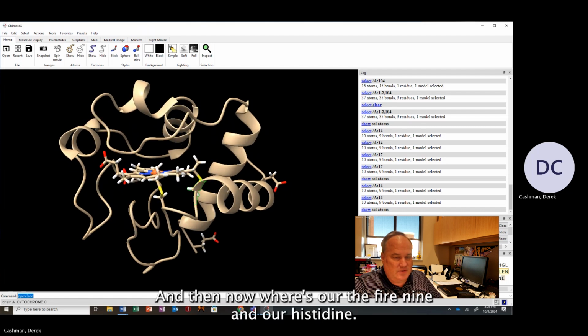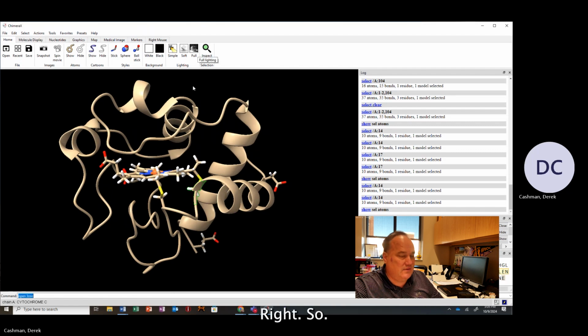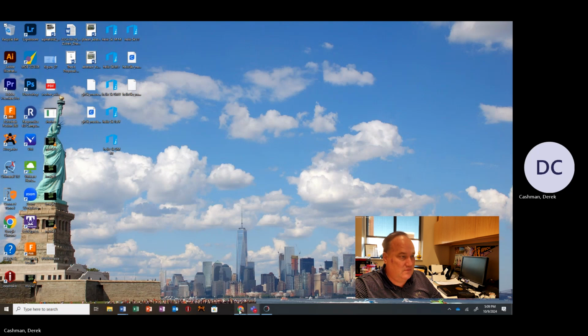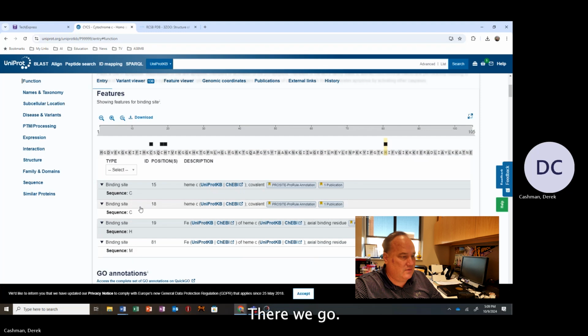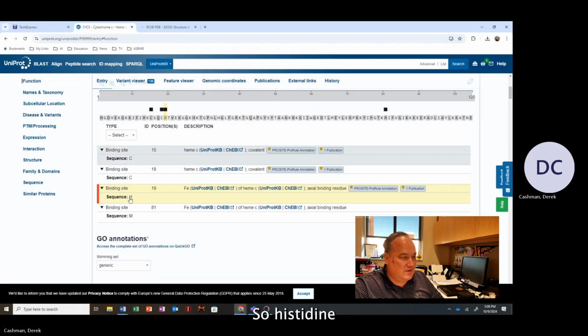And then now, where's our methionine and our histidine, right? There we go. So histidine, it looks like 19 and 81.